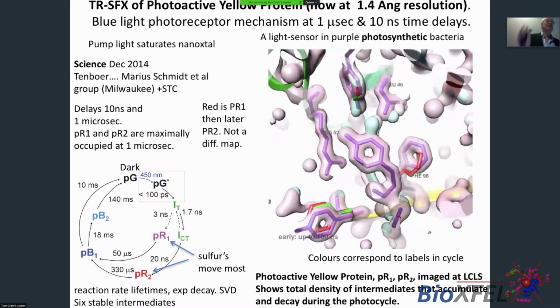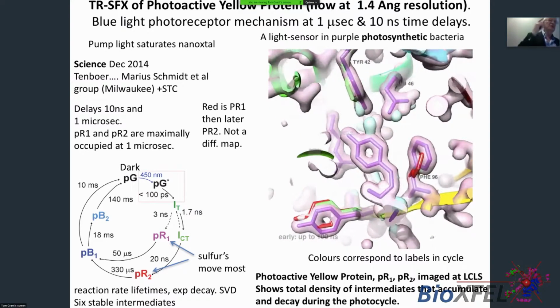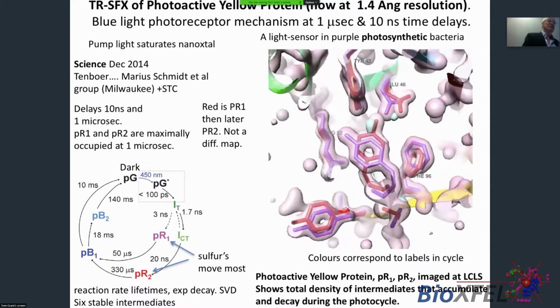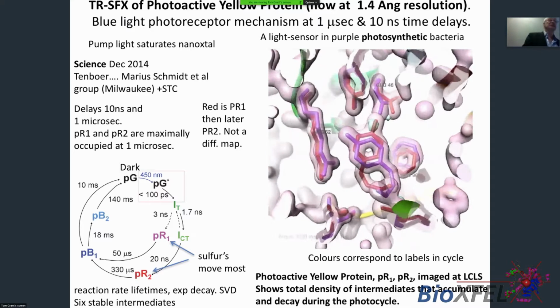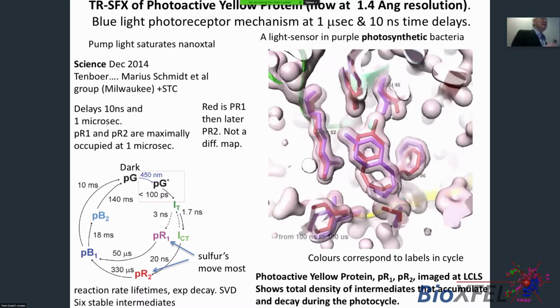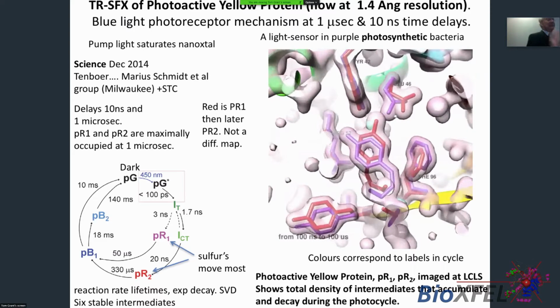But again, the thing to keep in mind is that this can be done at room temperature without damage. There are many previous studies where people quench in particular states, and you have to ask whether the quenching works and so forth. But the key unique capability we have here is to separate out any damage effects, by minimizing them, by avoiding them, from the effects of temperature, which is driving the reaction. So we see the reaction as it actually occurs in nature.